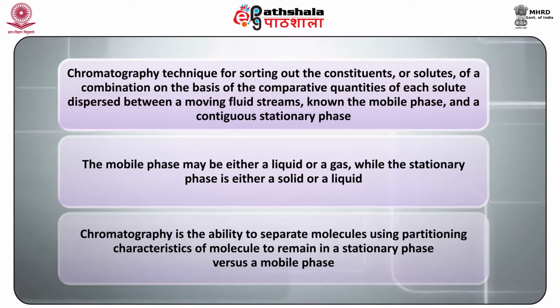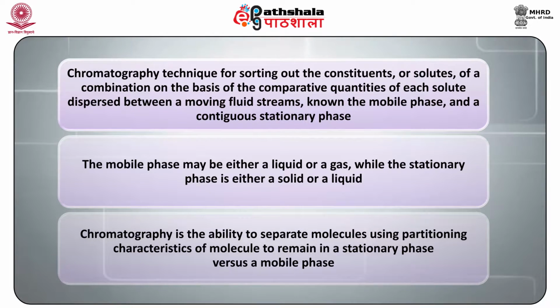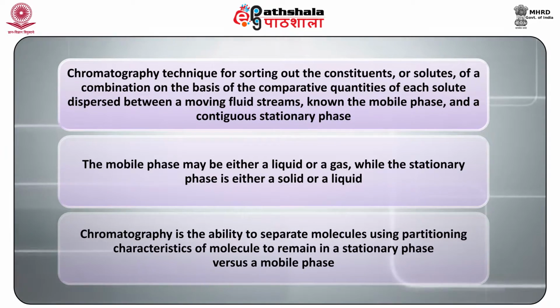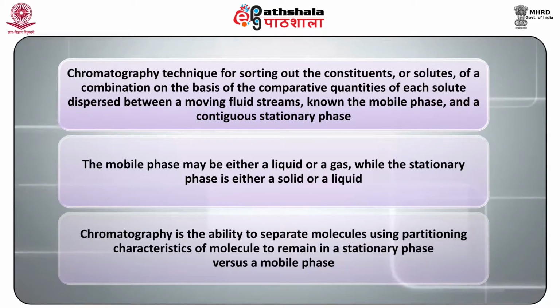Chromatography is a technique for sorting out the constituents or solutes of a combination on the basis of comparative quantities of each solute dispersed between a moving fluid stream known as mobile phase and a contiguous stationary phase. The mobile phase may be either liquid or gas, while the stationary phase is either solid or liquid.